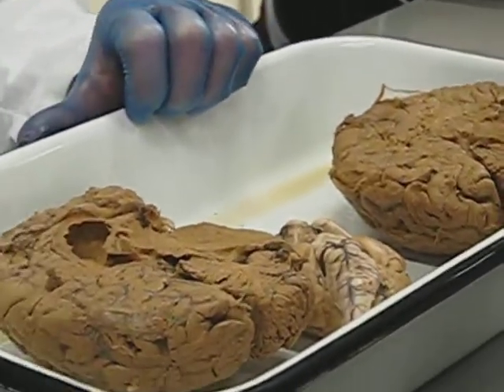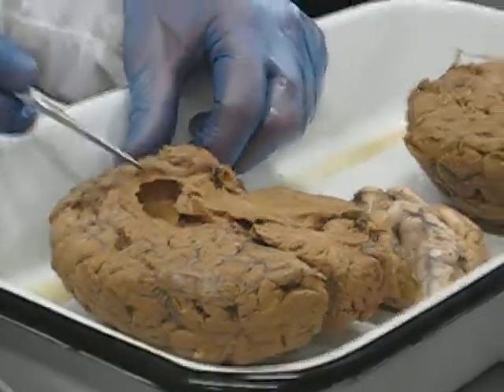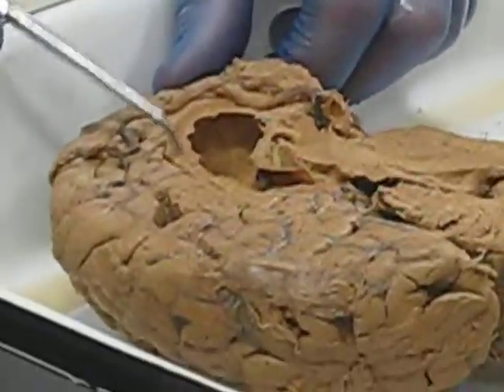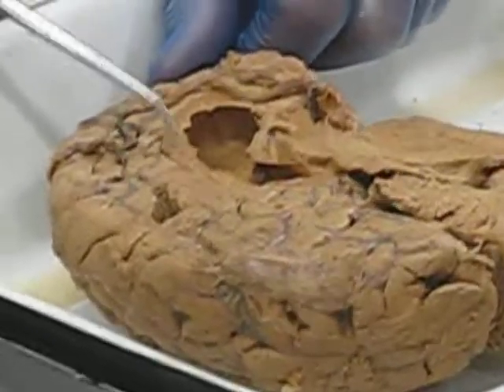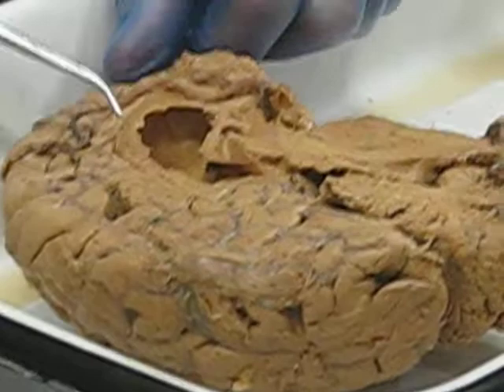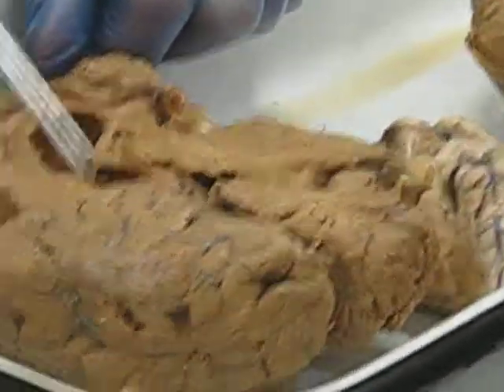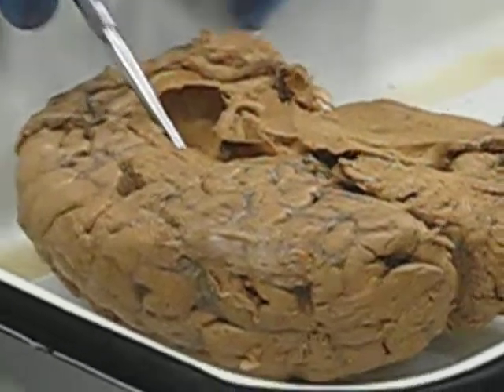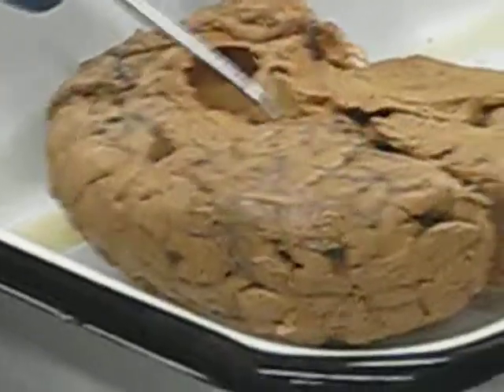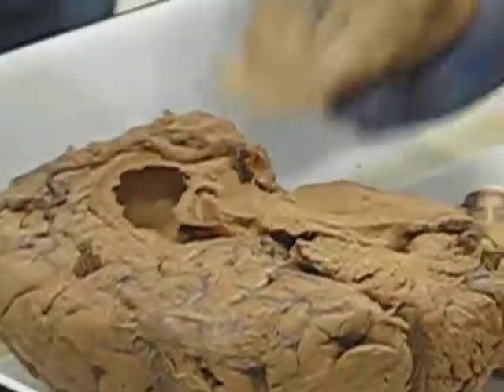The corpus callosum, we already did. That's the corpus callosum here. The rostrum is this part right there. This is a bridge between the hemispheres. Myelinated axons running from one hemisphere to the other. Corpus callosum. The first and second, or lateral, ventricles are here. The fornix is right there. The pineal gland is missing here, but I just showed it to you there.